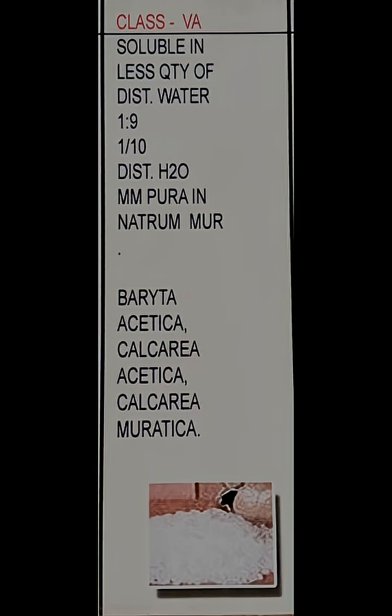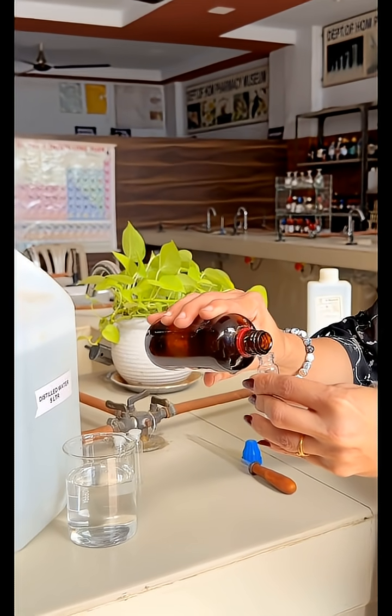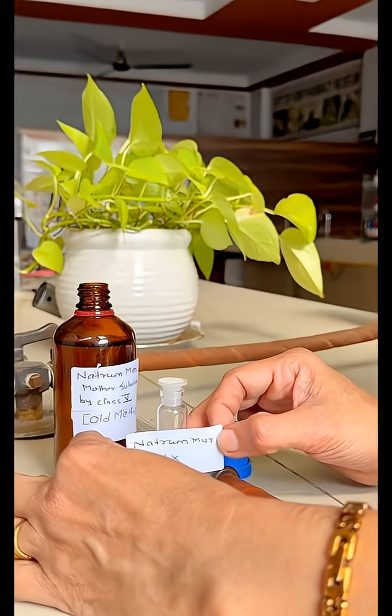The procedure: we are preparing Natrum Mur decimal potencies, and Natrum Mur belongs to class 5a of the old method. The mother solution itself is 1x potency. So this is Natrum Mur mother solution, which is equal to 1x potency. Let us label it as 1x potency.